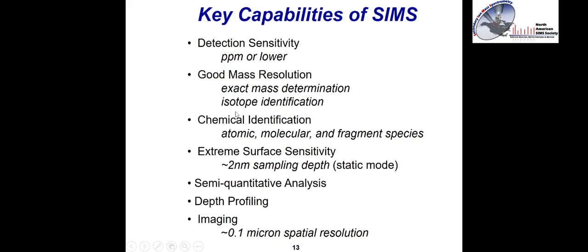Thank you. And even though the mass resolution is decently good, we still get the ability to determine the exact mass of molecules. We get isotopes. And we also can do chemical identification. As I mentioned before, we get both atomic, molecular, and fragment species.